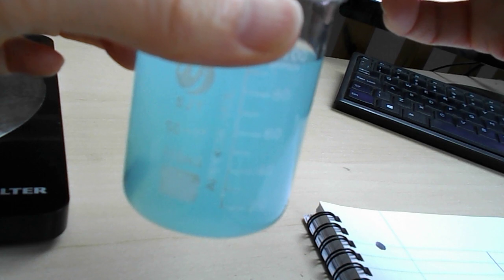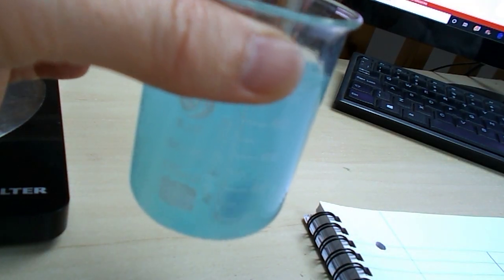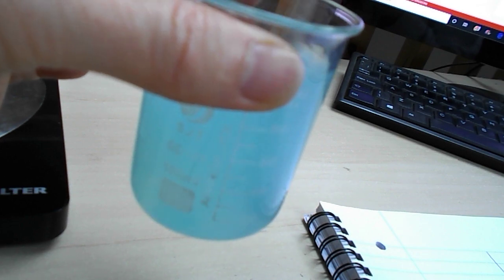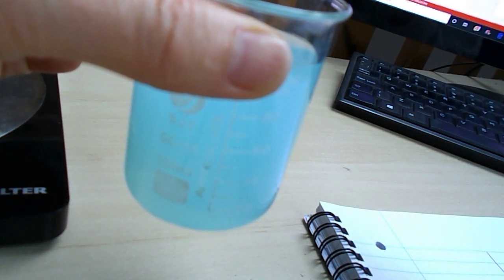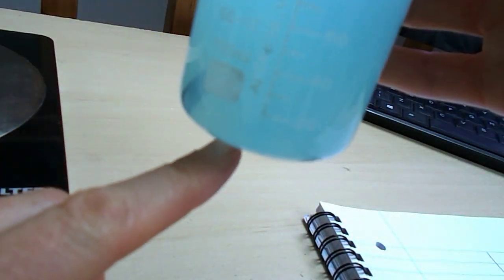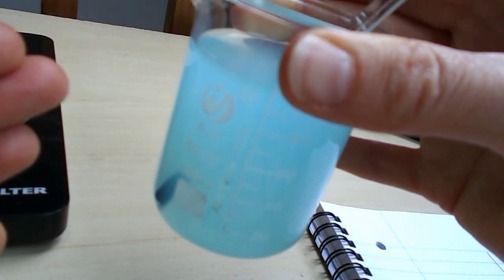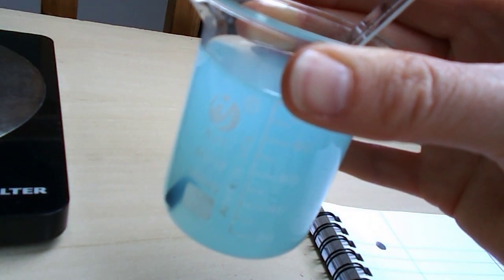So how do you think I'm going to know when I can't get any more dissolved? What might I see if the stuff isn't dissolving? So have a quick think there. So hopefully you've got the idea that we might be able to see on the underside of the beaker some of the solid particles that haven't dissolved. As soon as you get even one particle that won't dissolve, one crystal that won't dissolve, then you have got the maximum amount dissolved into your solution.